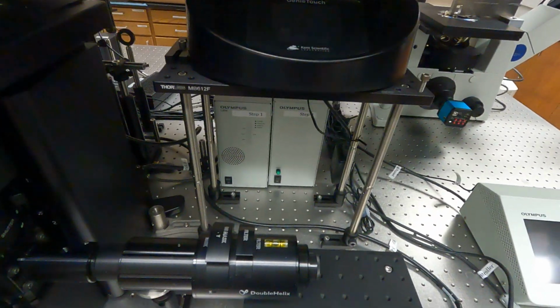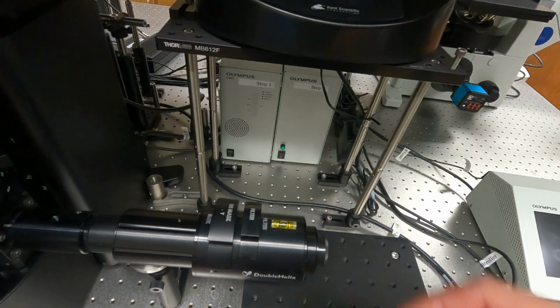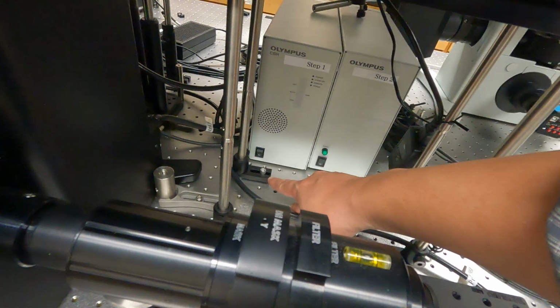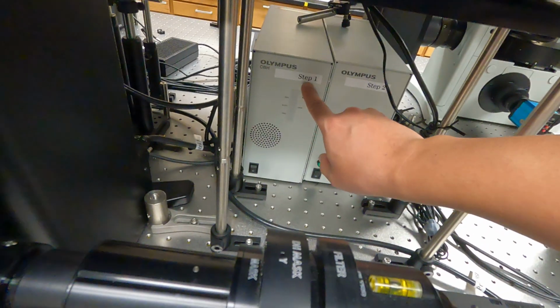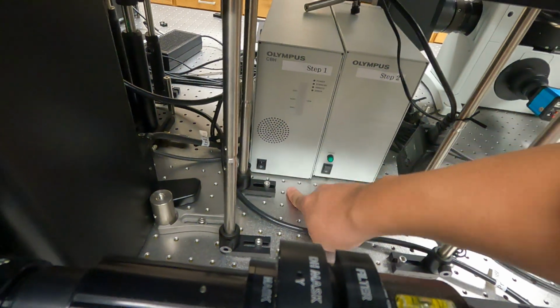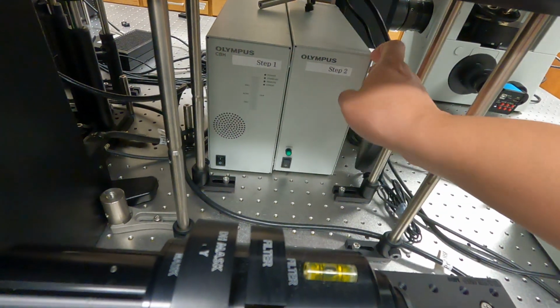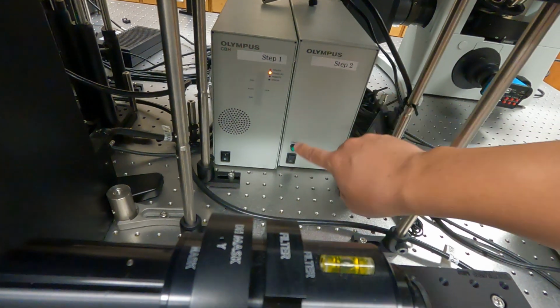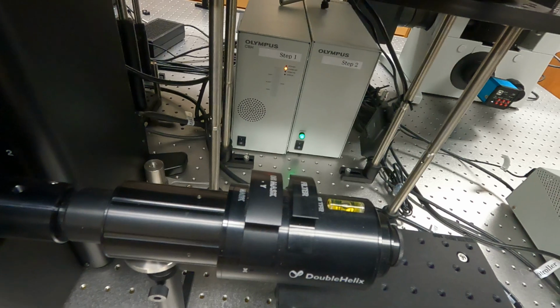It contains a bunch of buttons to turn on this microscope body. The first thing we need to do is to turn this button. You can see it indicates step number 1, which means this is the first thing we need to switch. Once it is on, we'll move to step number 2. Turn this knob. So this one will be on as well.